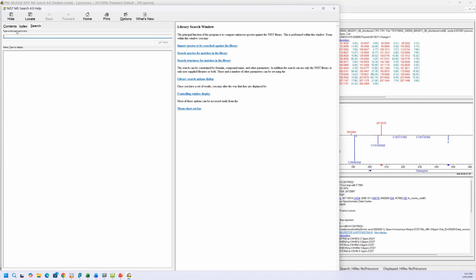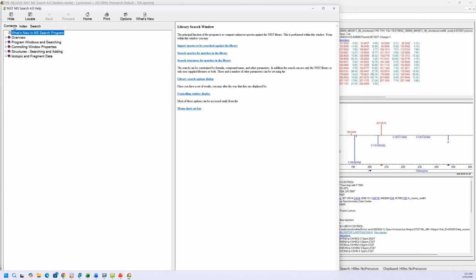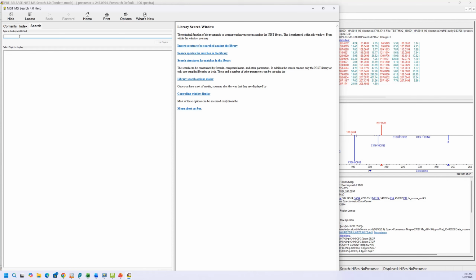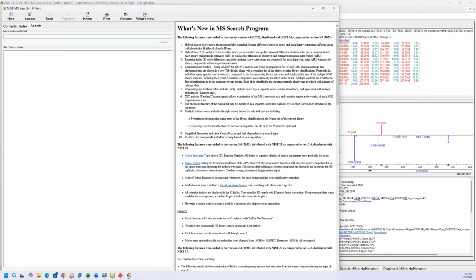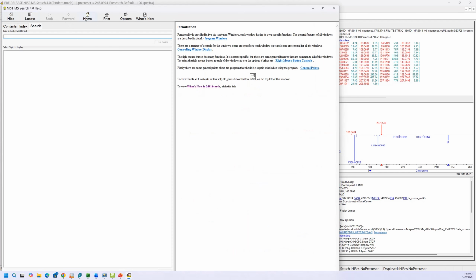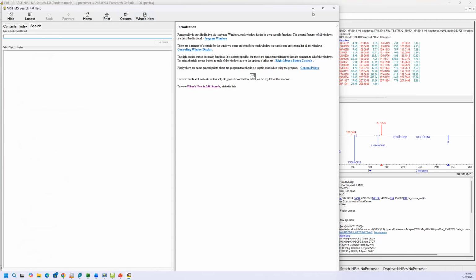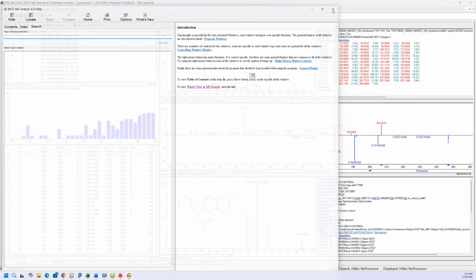And in addition to that, you have, of course, the ability to search the index by topics and the contents of the material, and of course the search of individual words, which is very useful. We have this What's New, which tells you what's new in this version and also in all the past versions. This is somewhat duplicated by going to Help Topics, and you can do the same thing. You can look at the contents, the index, the search and What's New. So it's essentially another way to get to the same place.